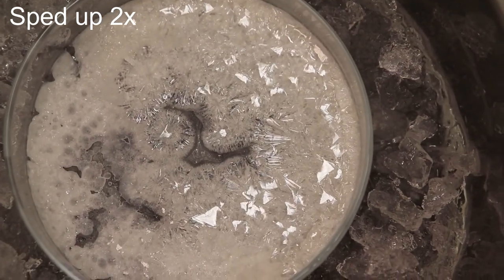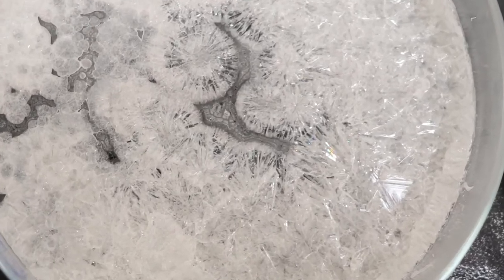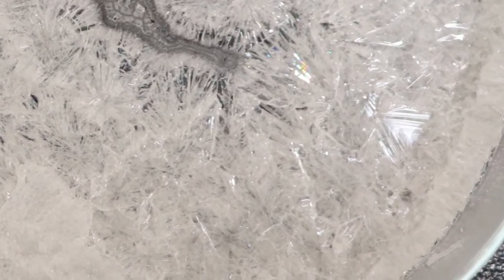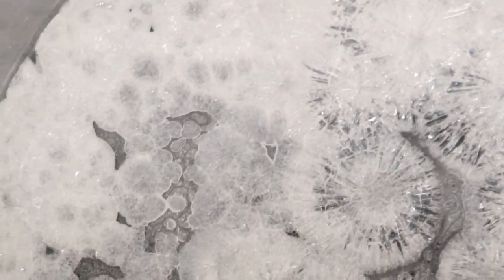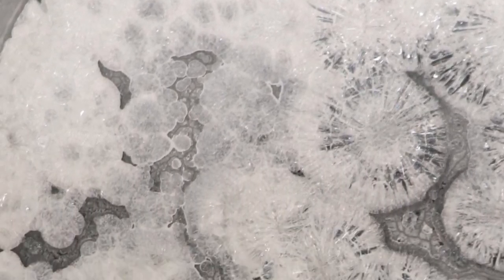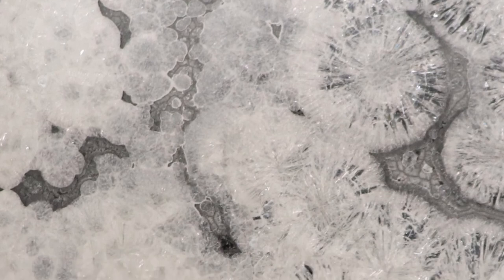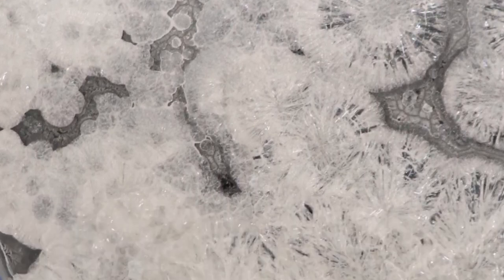All right, now that it's all done, we're going to zoom in on a single image of this last experiment. See on this side how the crystals are well defined, and you can kind of see their rhombus shapes. When we pan over to the side that grew in the ice bath, we see crystals that grew very rapidly. We can see the white, but the crystals themselves are too small to distinguish from each other.